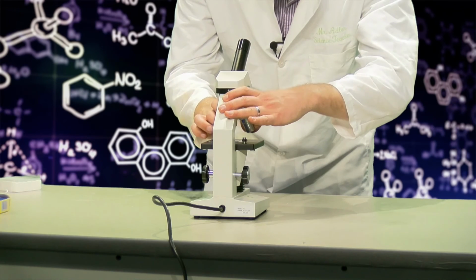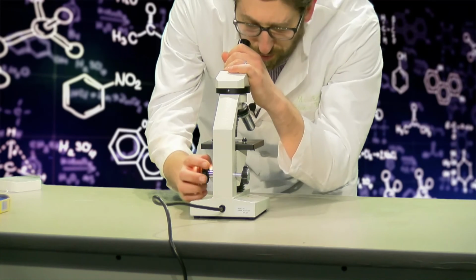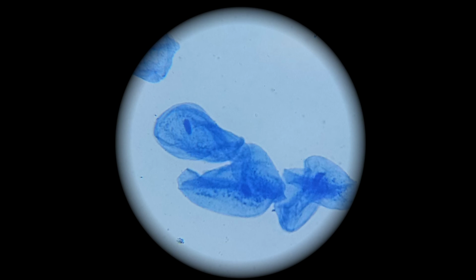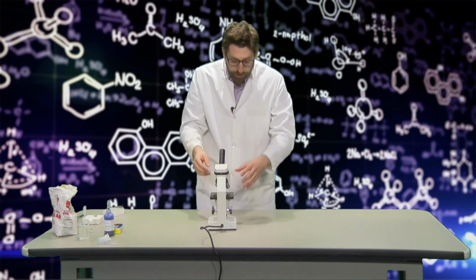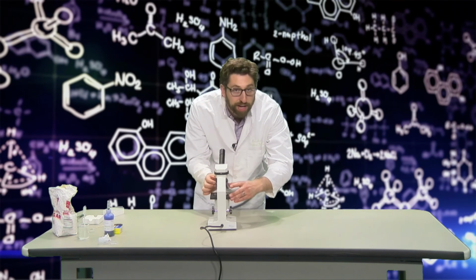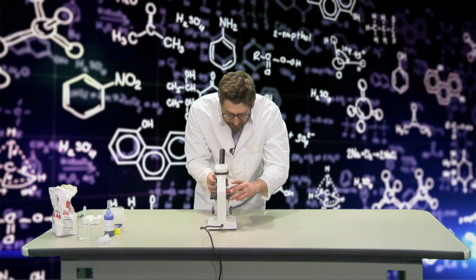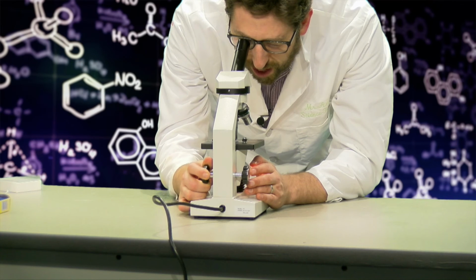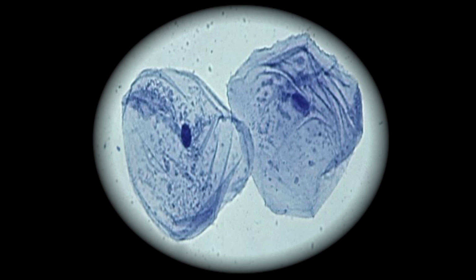I'm going to turn to my 10 times objective lens. Now I need to bring this back into focus. Oh, it's getting closer. I can see the objects much clearer, but I want to see them even closer. Going to my final lens, my 40 times lens. Oh man, and now I can see these things that were inside my cheek really close up.